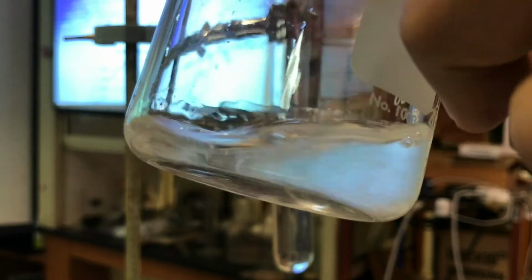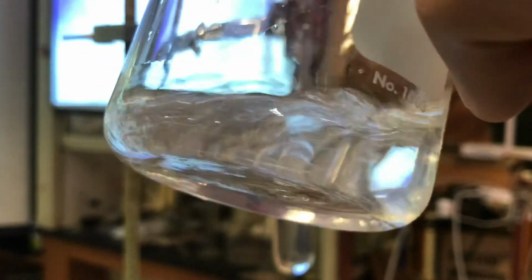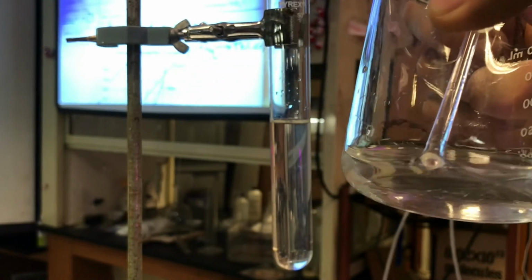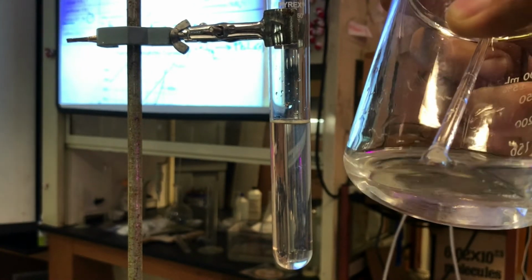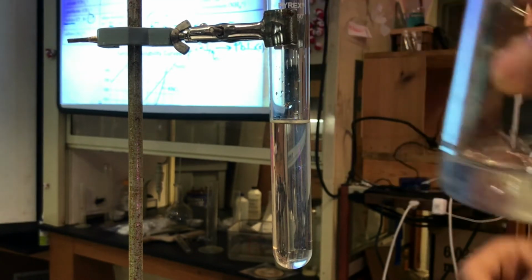Notice water's competing with those charges very well, because what's happened to that solid? Those ions are now free. And now I've got a dissolved, homogeneous aqueous solution of K+ and I-. We may write KI aqueous, but that's a lie. It's a Kardashian wedding, right? They're not really together. It's K+ and I- ions. All right, so now I'm free.